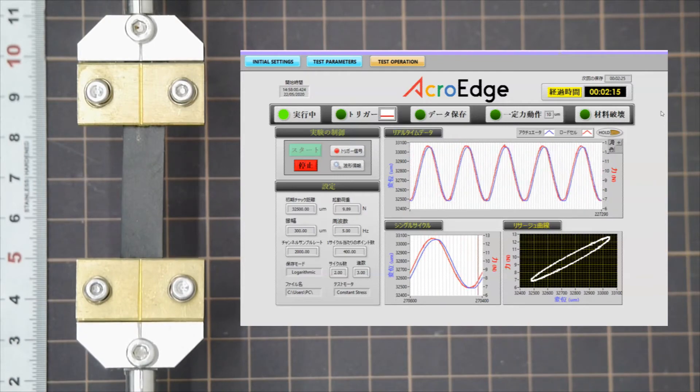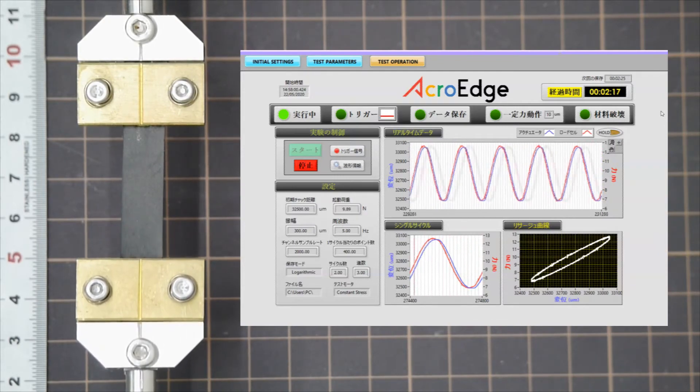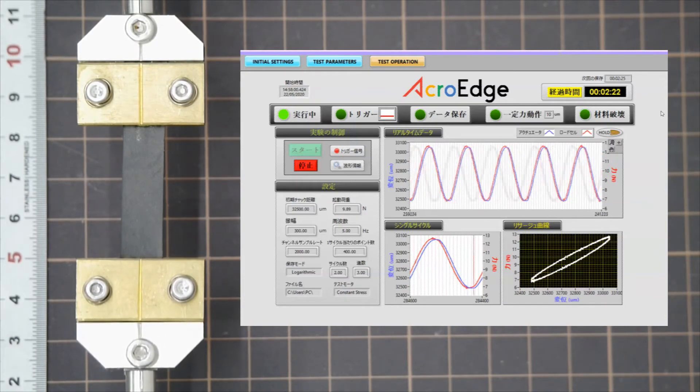By applying repetitive cycles of load, Cyclos emulates the practical stresses experienced by a material during service until failure.